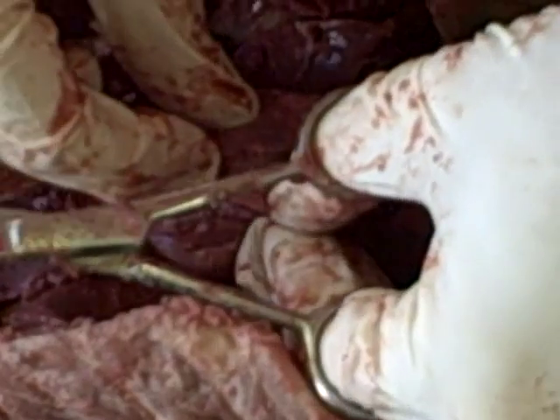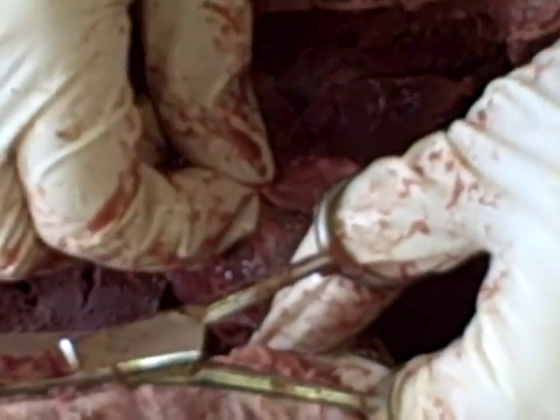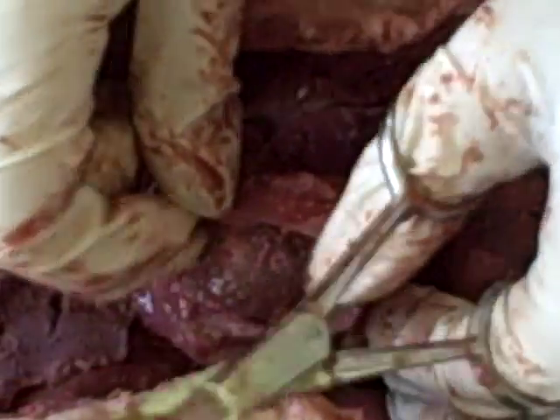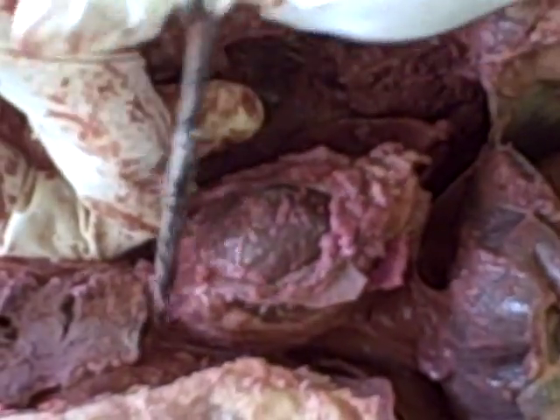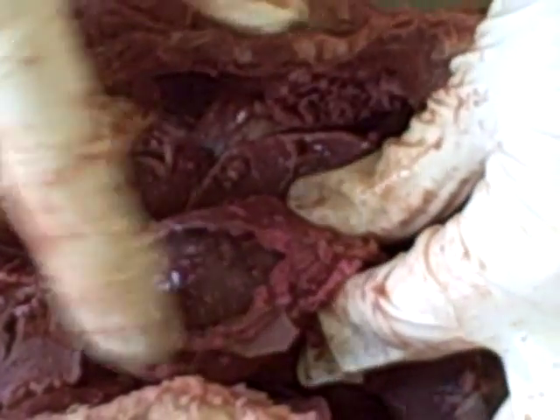You will not have to know this for the exam, but it's quite interesting. Quite often, people will get an infection of this tissue that surrounds this organ. Get this up here and down here. There we go, revealing the organ inside. The next question would be, what is this organ, the central organ in the middle?